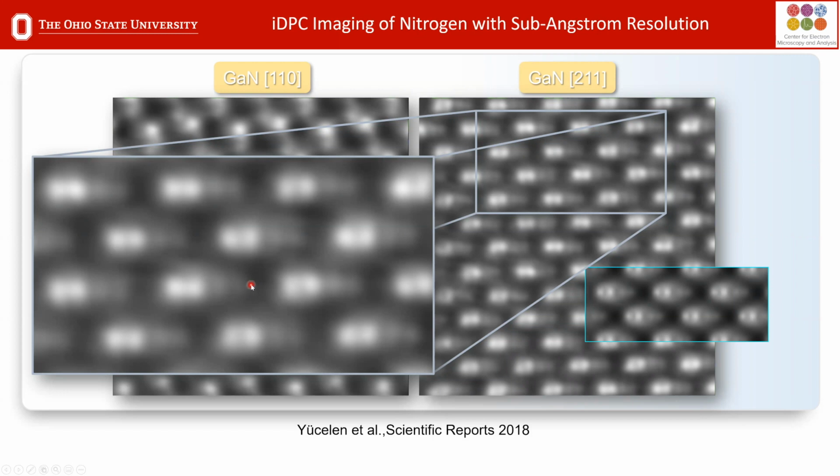until recently, we had no way to image atomic resolution very well until a few years ago. And now we've made such technological advances that not only can we image almost distortion-free in atomic resolution, but we also can image light elements all the way from nitrogen and oxygen.